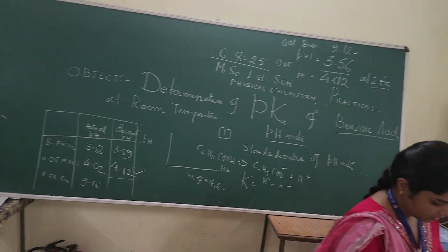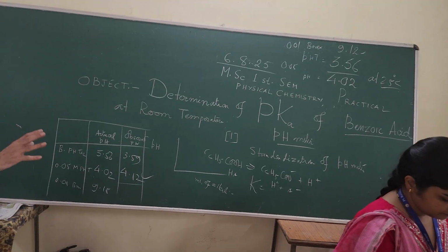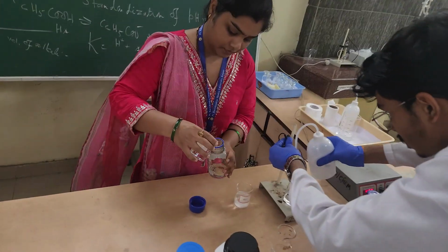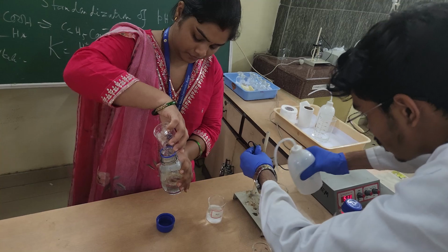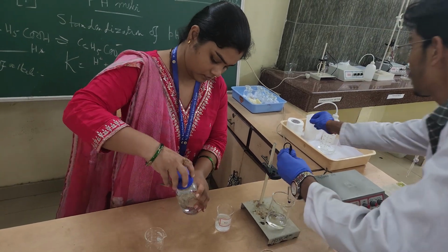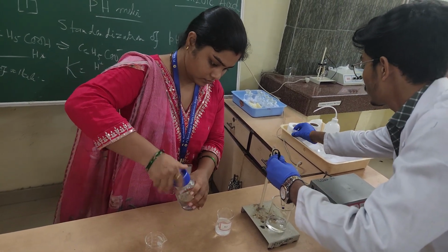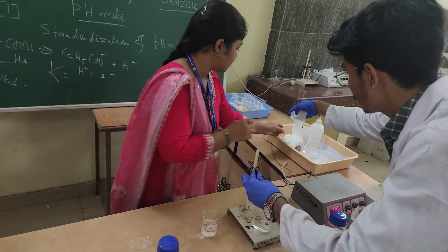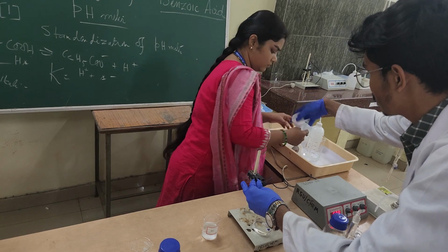Write down your fair copy so that there will be no manipulation and other things. Wash it and then you start this experiment. Wash it properly.